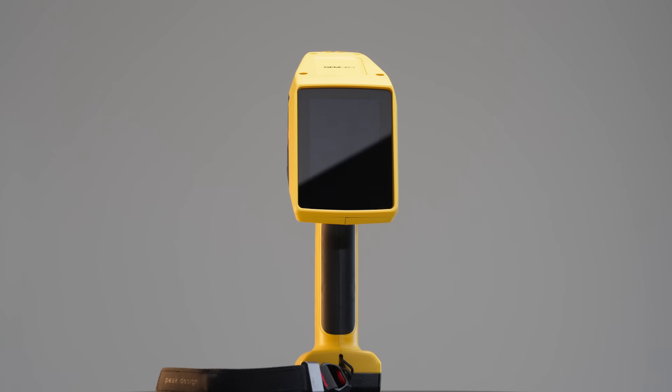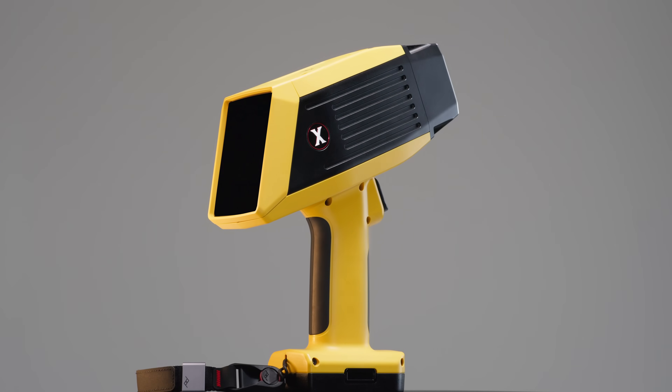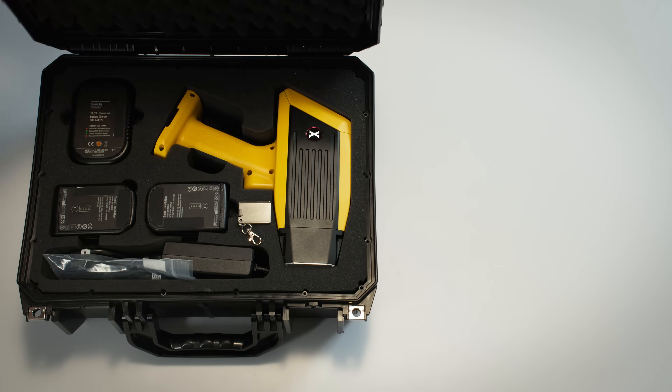Whether you're testing gold, platinum, silver, stainless steel, or other precious metal elements, it scans up to a depth of 10 to 20 microns and tests with parts-per-million level accuracy. Let's unbox it and get it set up.